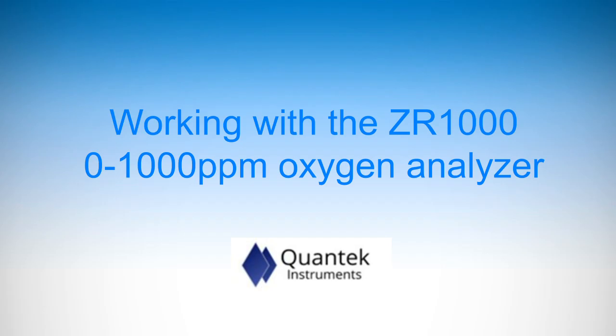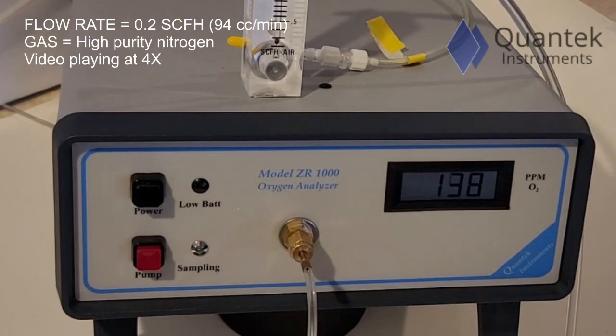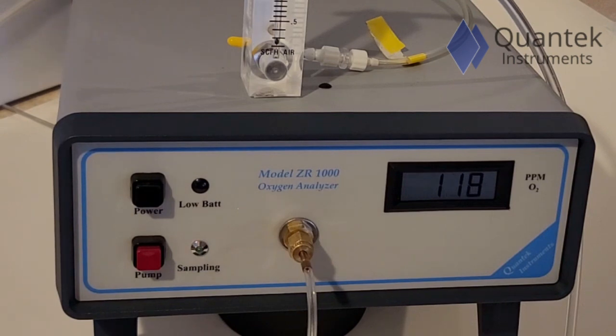Today, we'll be working with the Quantek Instruments ZR1000 0-1,000 ppm oxygen analyzer. First, we're flowing 94 cc's a minute of pure nitrogen directly into the instrument without activating the pump.